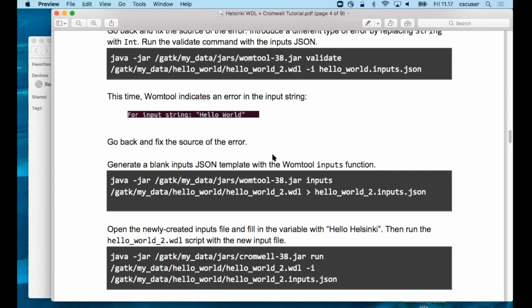So you run through the workflow and it fails. So you use probably a value substitution for that. Does it show what command it runs? I will show you that. If it's not a syntax error, if it's a tool error, I'll show you how you can look into that.